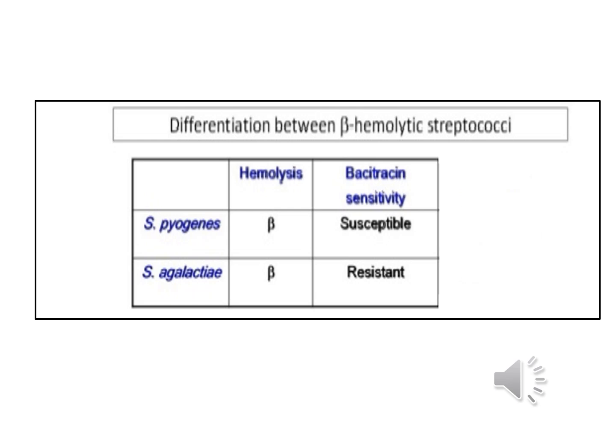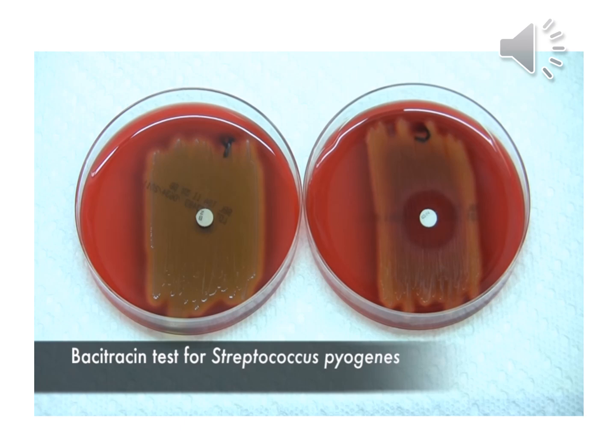The bacitracin susceptibility test is used to distinguish Group A Streptococcus (S. pyogenes) from other Streptococcus such as Group B Streptococcus agalactiae. When grown on blood agar, Group A Streptococcus is sensitive to bacitracin and shows a zone of inhibition around the bacitracin disc, while S. agalactiae is resistant to bacitracin and will not show a zone of inhibition. The right blood media represents S. pyogenes since it is sensitive to bacitracin, while the left represents S. agalactiae which is resistant.